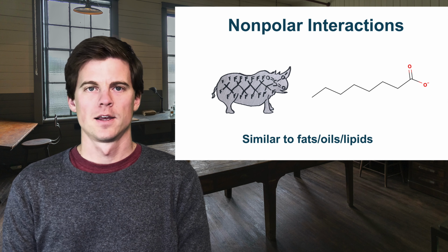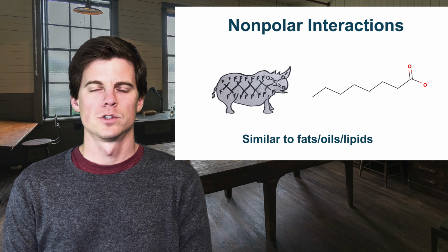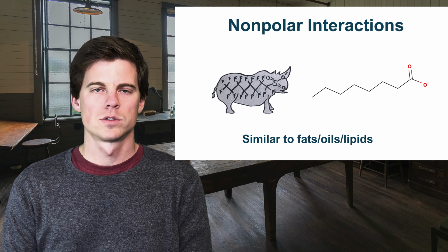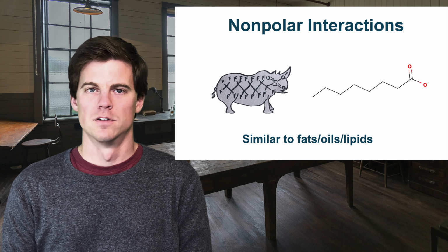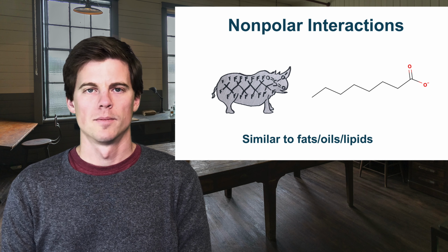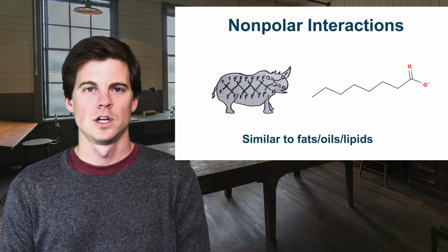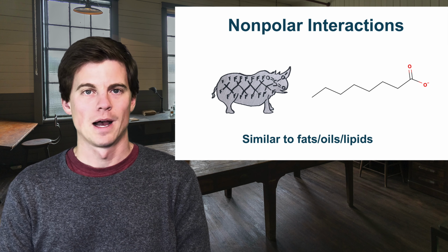Practically, what does this look like? There's a few different ways to get PFAS out of a solution. Nonpolar interactions would be the number one way. PFAS in general are nonpolar. All those CF bonds, all those fluorines covering the carbons, really make it not like water, and it can dissolve a little better in solvents. Although with the charged end that you normally see on them, like our PFOS here, which is negatively charged, that will interact a lot with things like water and methanol that are protic and can do hydrogen bonding.